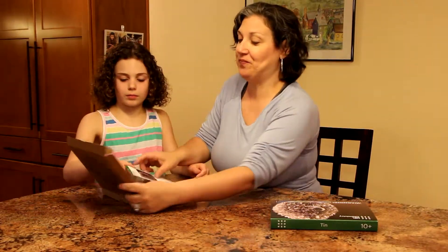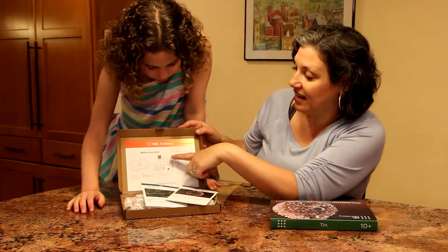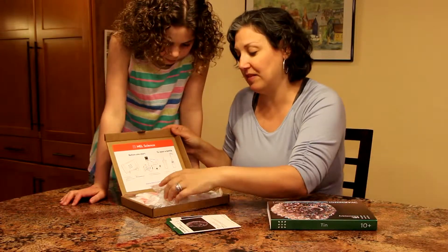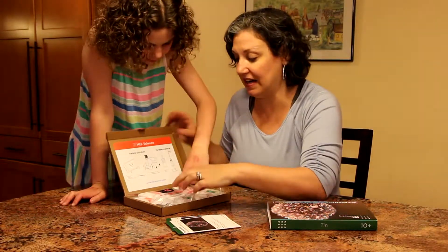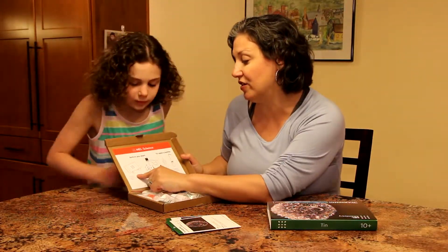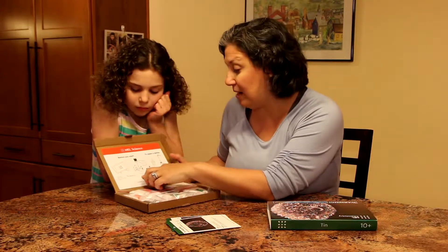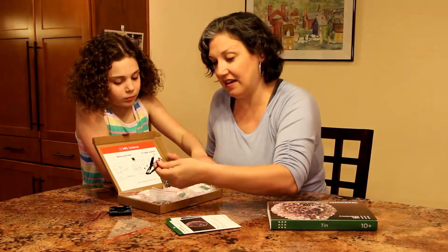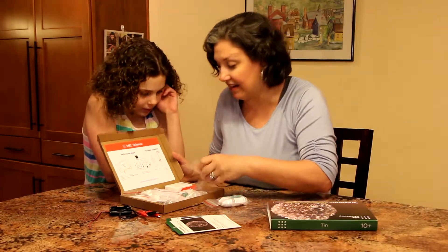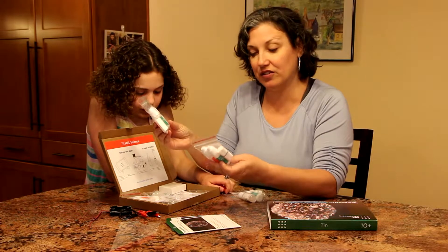So it has here on the inside of the box, before you start, and it gives you instructions on how to open the bottle. It looks like we're going to need a paper clip. So it says secure your smartphone or tablet on the provided stand — that was in the starter kit. Launch the MEL Chemistry app, batteries and some electrical equipment. They did give us a paper clip — and they even gave us a bent paper clip. So these are the bottles of the reactants so that you can do the tin experiments.